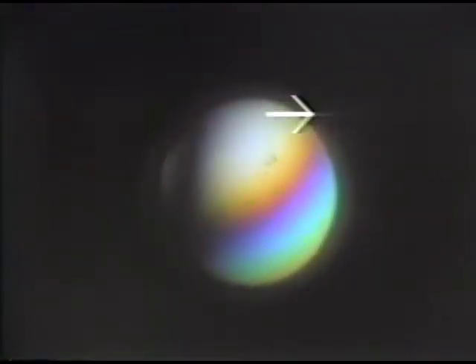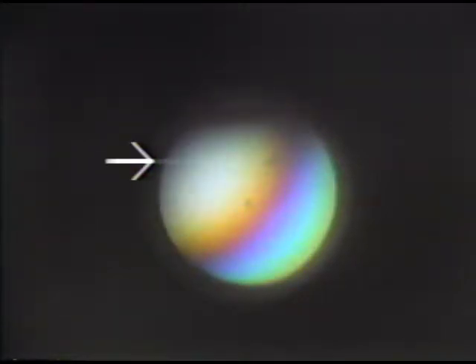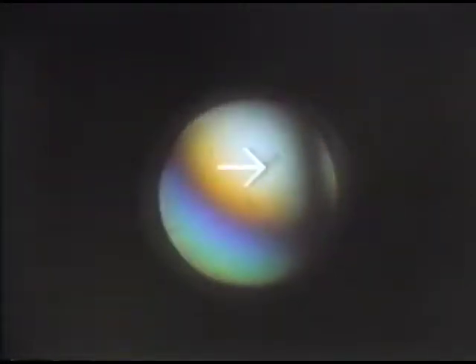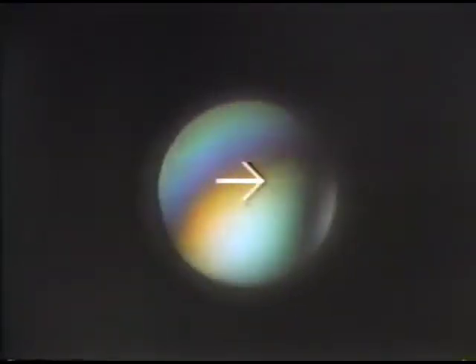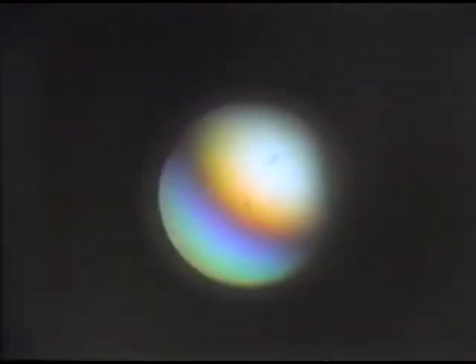And so as the figure rotates and as the isogyres traverse the field, you can, by watching the figure, recognize that, for example, now the intersection of the isogyres is in the northwest quadrant. Now it's moved over to the northeast quadrant, now it's in the southeast quadrant, now it's in the southwest quadrant. So I want to rotate it back until the intersection of the isogyres is all the way around again into the southwest quadrant. This puts us in the northeast quadrant of the orientation, and now I know that the O ray in this orientation is located in the northwest direction.